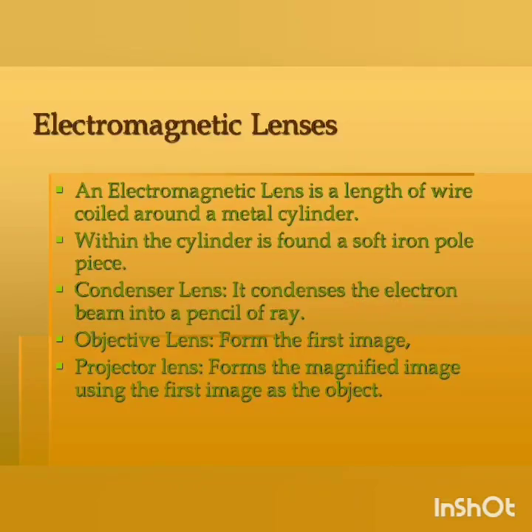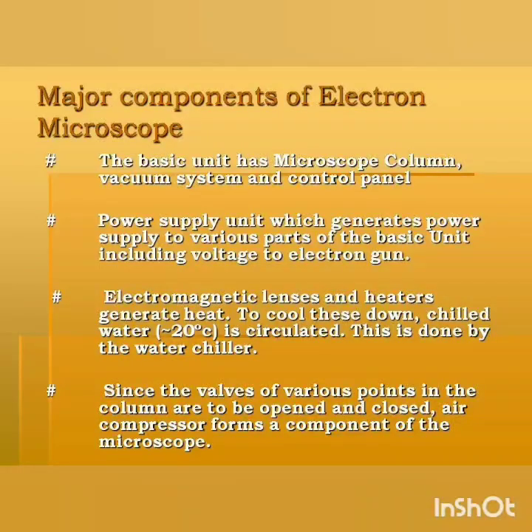The lenses seen in both scanning and transmission electron microscopy are not actually visible because they are electromagnetic fields. The microscope column consists of the illuminating system, electron gun and condenser lens, imaging system, and image translating system.